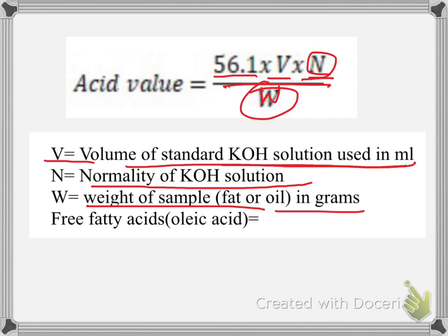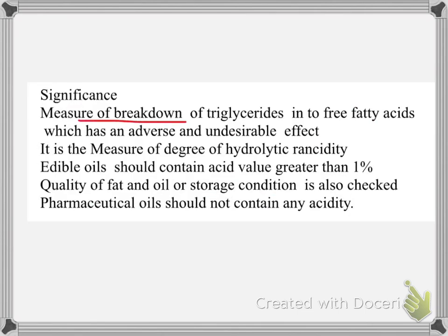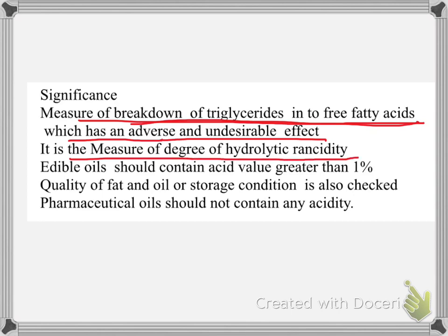Now let us see the significance of the acid value. It is used to measure the breakdown of triglycerides into free fatty acids, which has an adverse and undesirable effect. Similarly, it is the measure of the degree of hydrolytic rancidity.